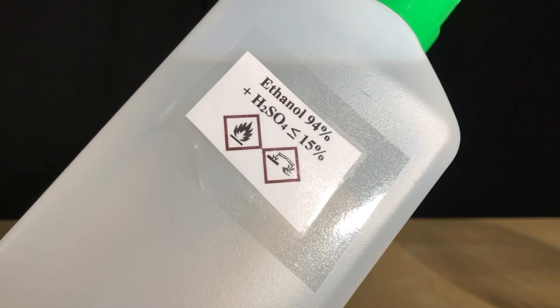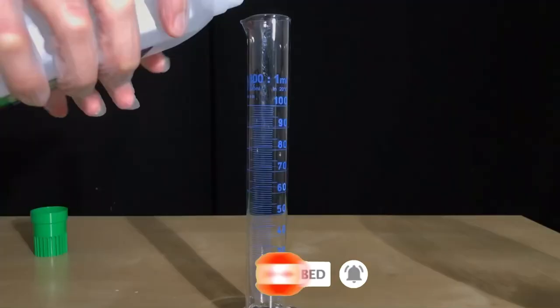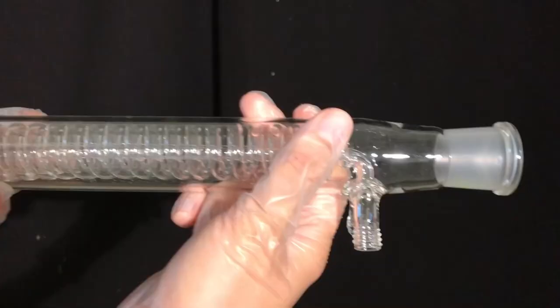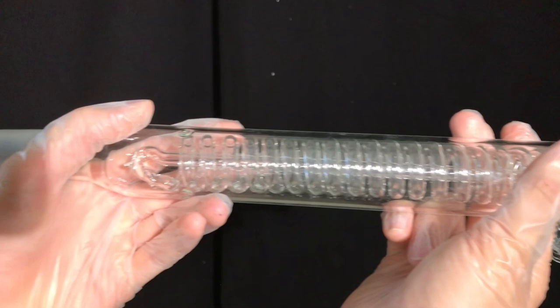To keep everything legal, sulfuric acid was diluted to the legal limit before the ban. Ethanol is one of the alcohols I diluted it with, and this ethanol-sulfuric acid solution will be used today. About 90 milliliters of solution were used. Even more might also be okay because we are already using an excess.